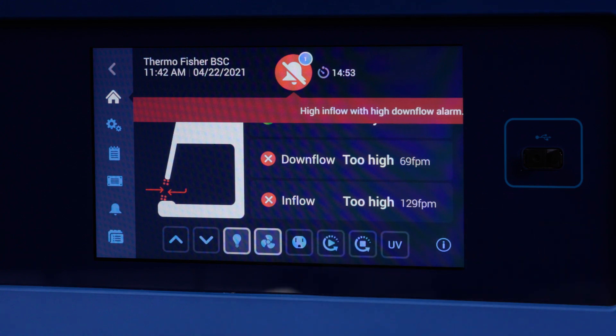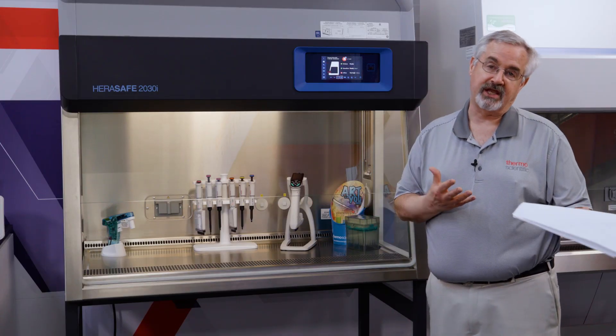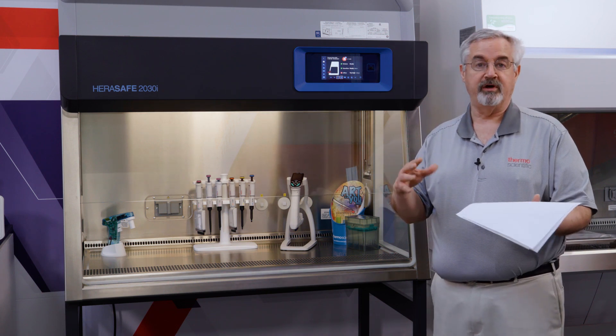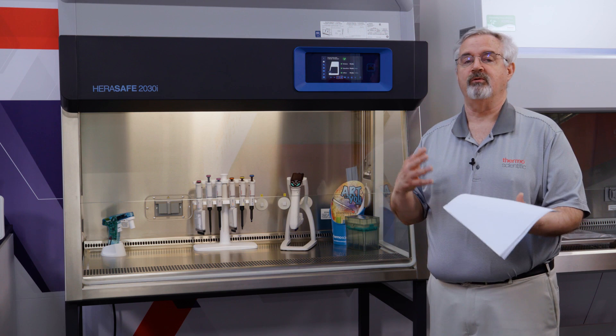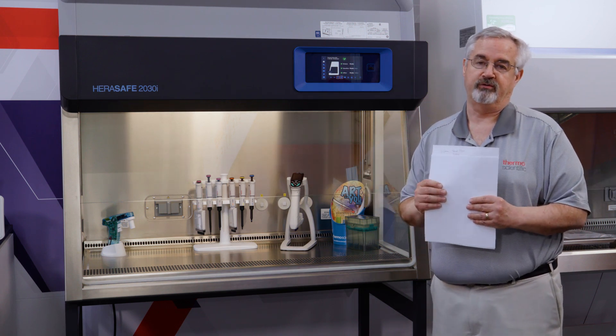We see it also represented in this icon here, showing that the air barrier is compromised. The user needs to think about whether there are hazardous materials that should perhaps be contained before they can escape from the cabinet, or whether there's a product or work at a point of particular vulnerability where they may want to protect from particles coming in from the room environment through the front opening.